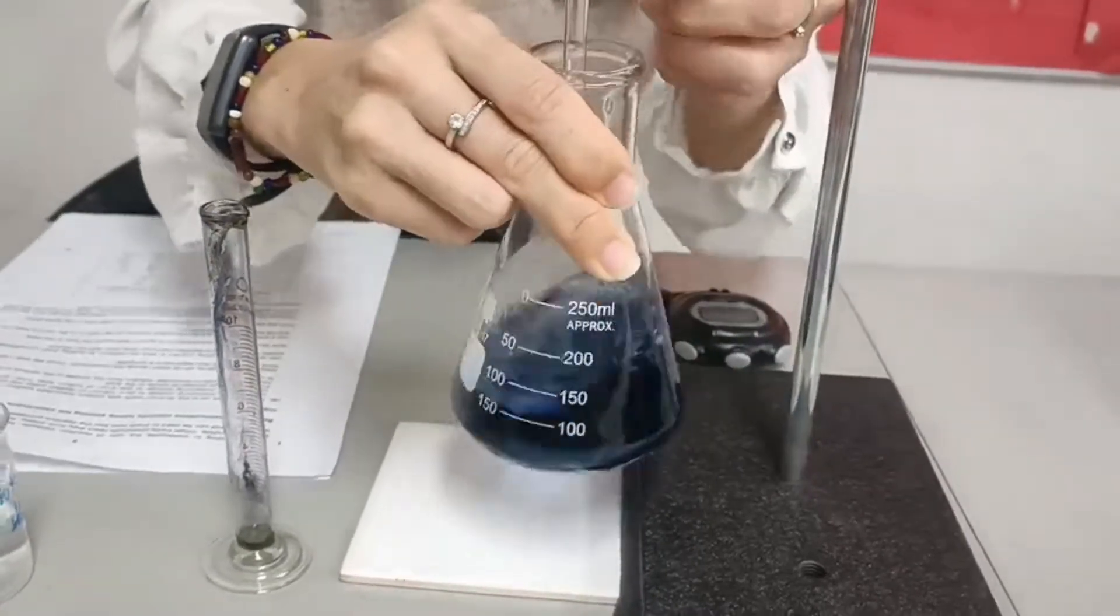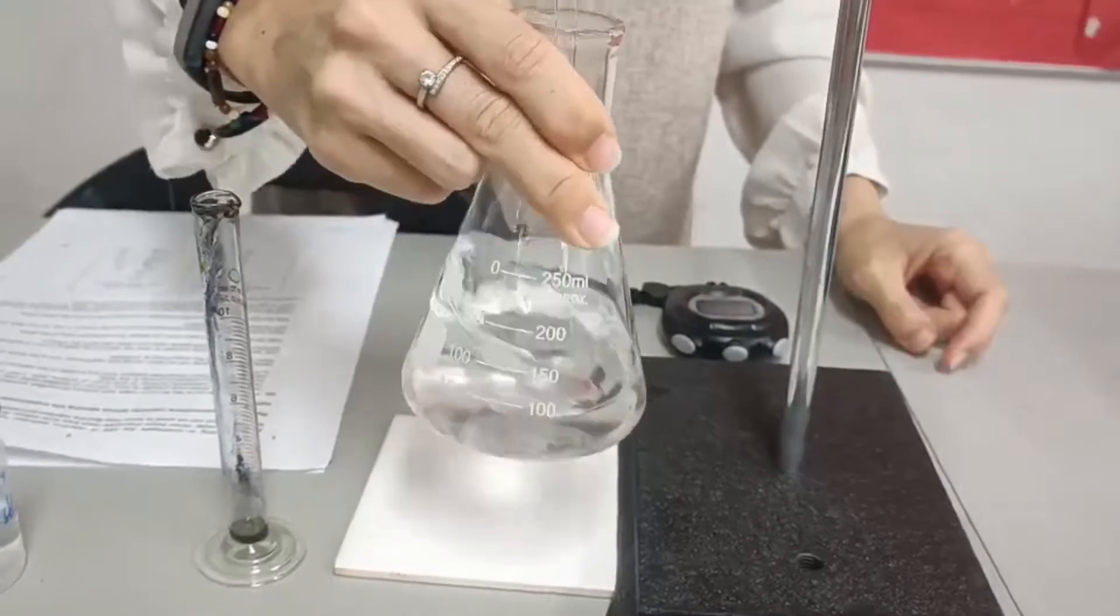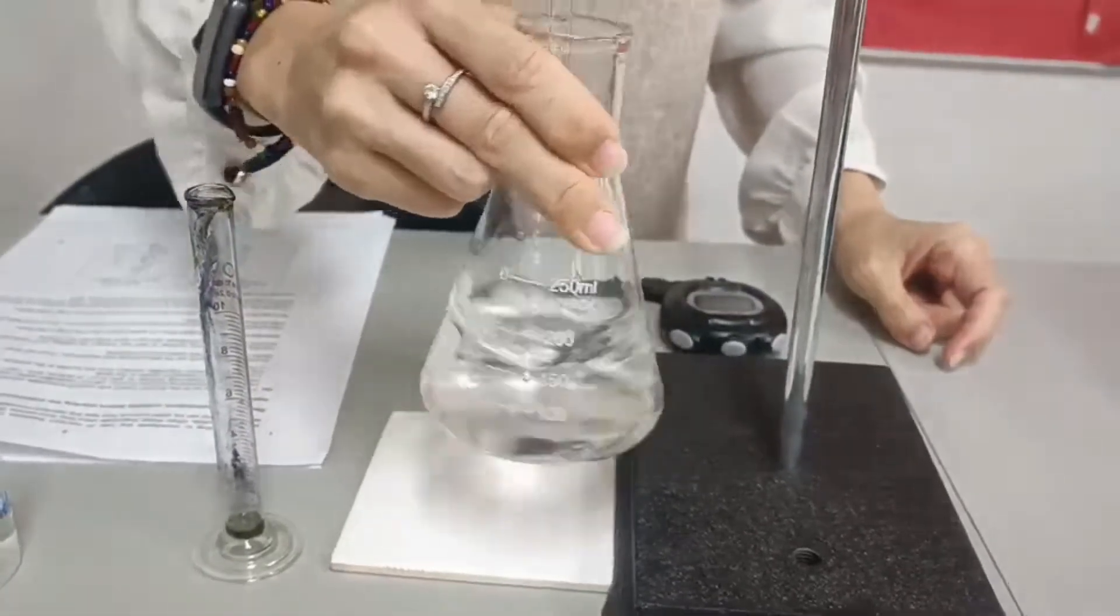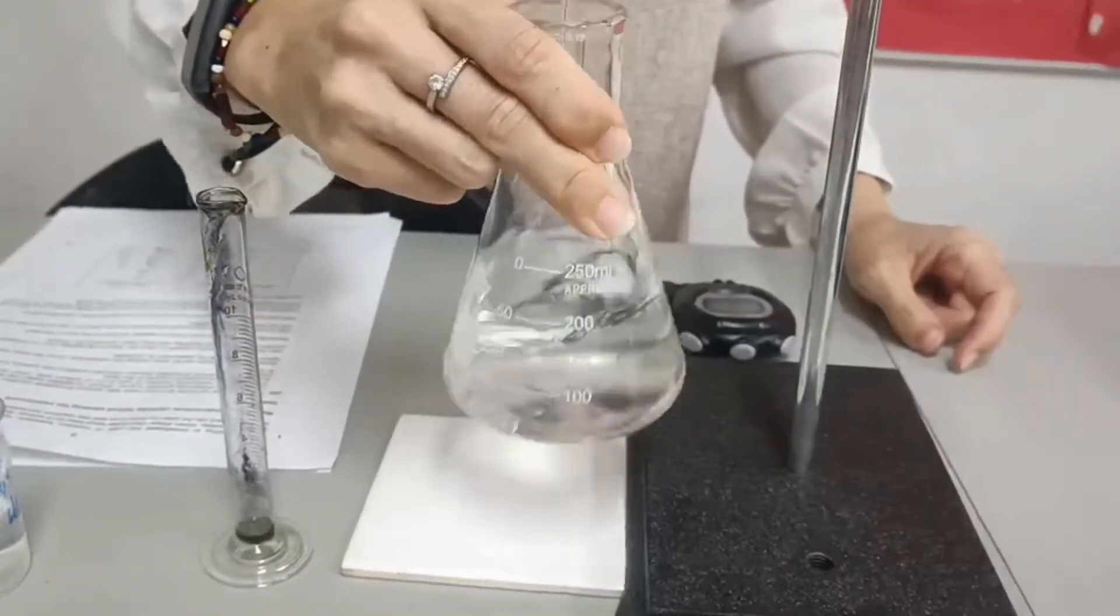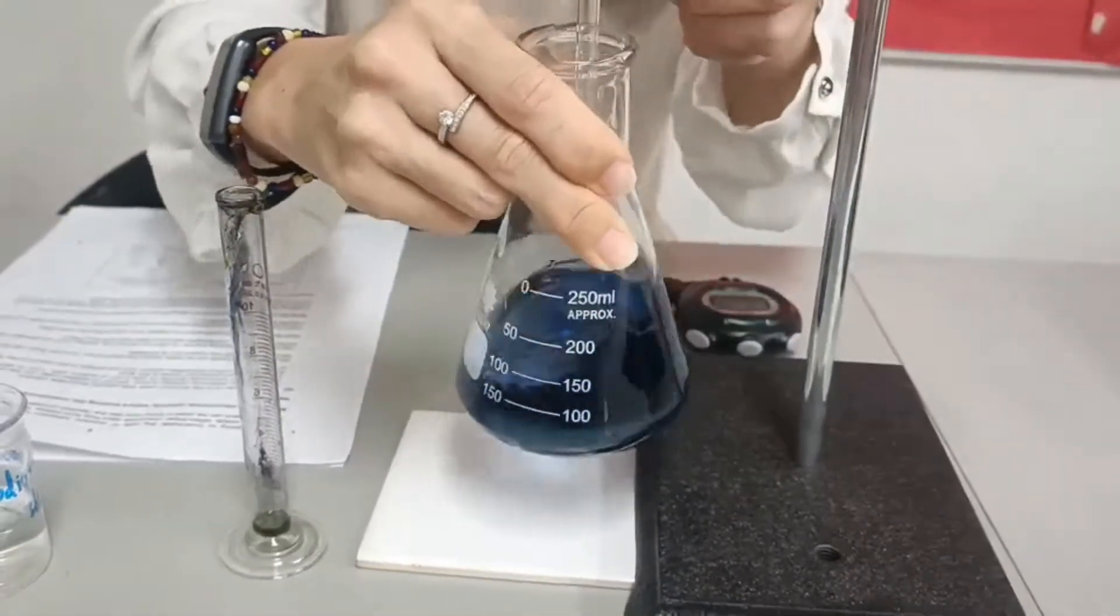And then, add more thiosulfate by 0.5 ml. And note down the time when it turns back to blue. That's your third time.